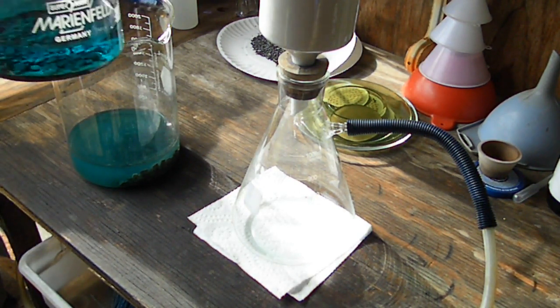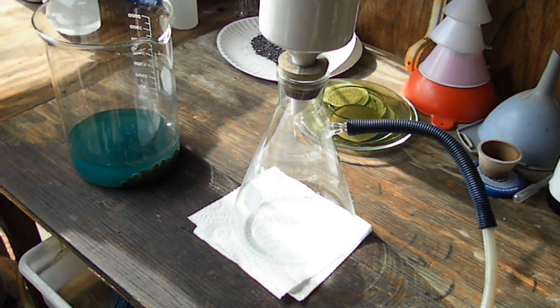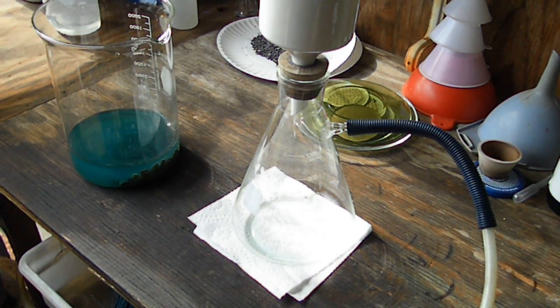Then we'll do the little round guys separately, because I'm going to test each one of these separately to make sure we're not going to have a problem dropping it with copper. If we do, we'll have to drop it with salt water or HCl. But I'm going to go ahead and go through this filtering process. Like I said, this is the boring part. You don't need to see it. So we'll get back at you after both of these beakers have been filtered out.